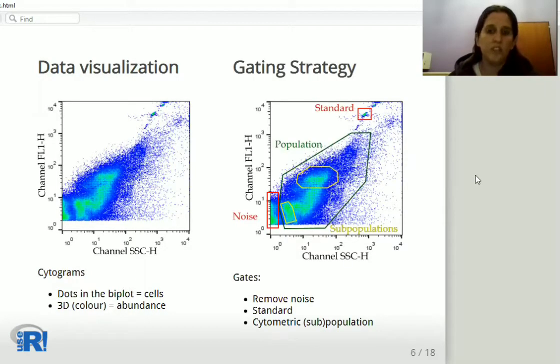We generate gates to remove noise and identify the standard and the cytometric population of interest and subpopulations.